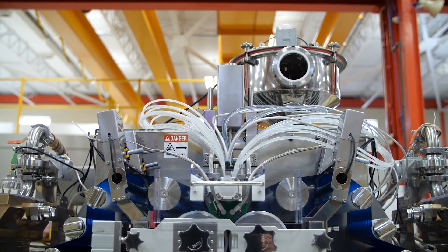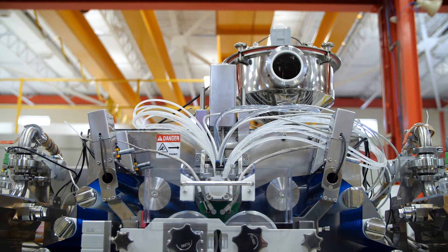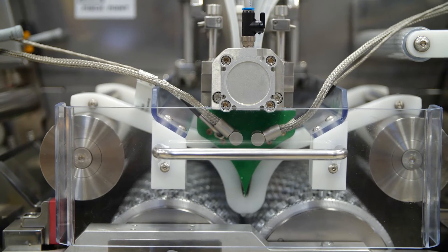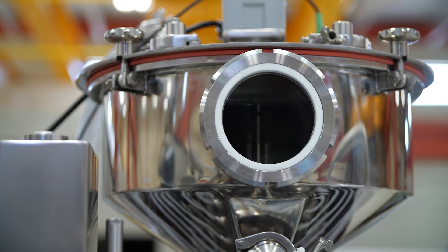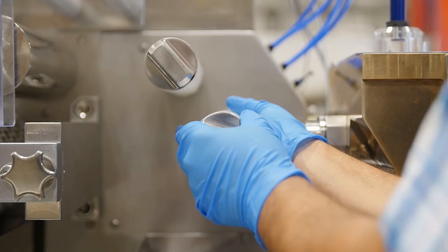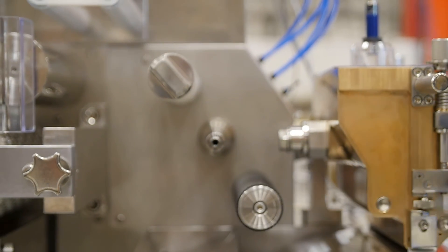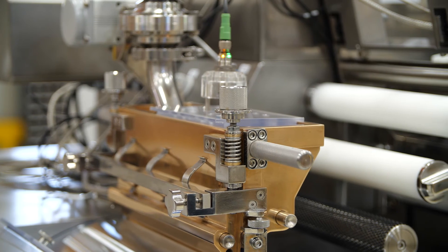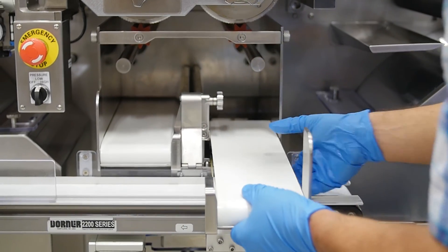The SGM-612 NextGen was designed with regular cleaning and change-overs in mind. In fact, much of the machine can be cleaned without disassembly. Out of the components that do need to be removed, like the oil rolls and conveyors, many of them can be removed without the use of any tools, with the advantages of new quick disconnect features.